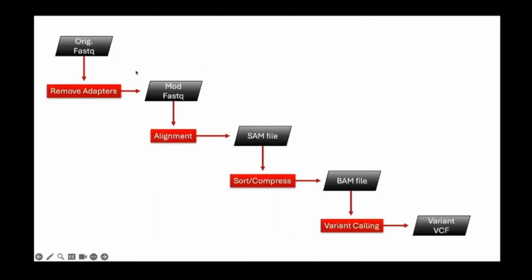and that's our FASTQ file. So now let's imagine putting together a little pipeline to process this data with different steps, and at each step we're going to get a different file output. We'll focus this on variant calling. We may have multiple steps, including some upfront steps to do things like removing adapter sequences. But there are really 2 key steps in this process.